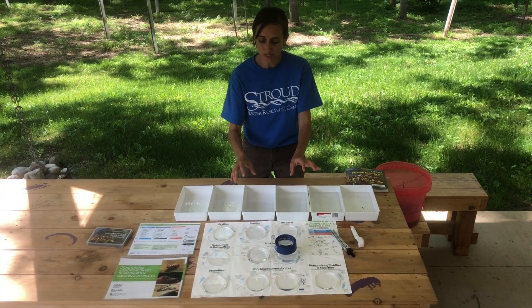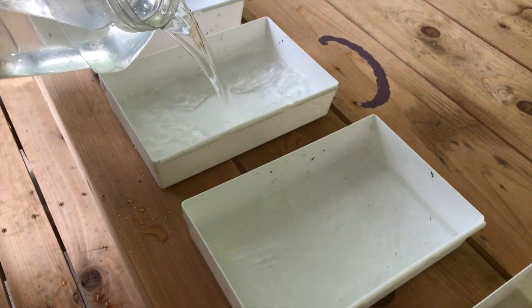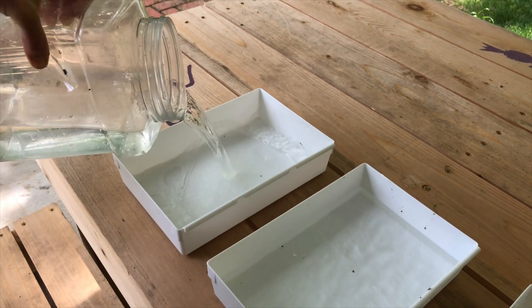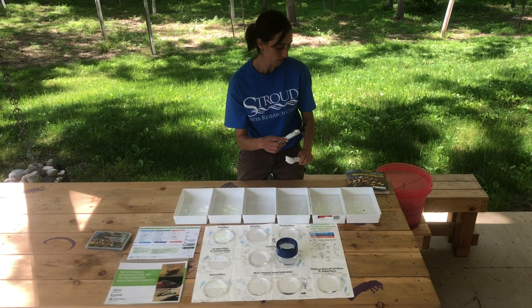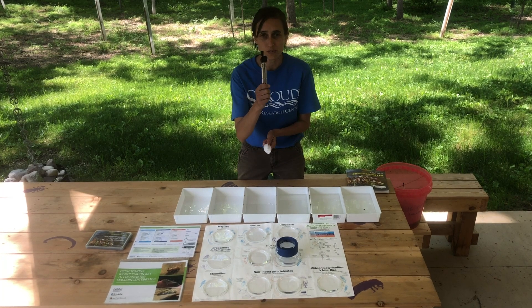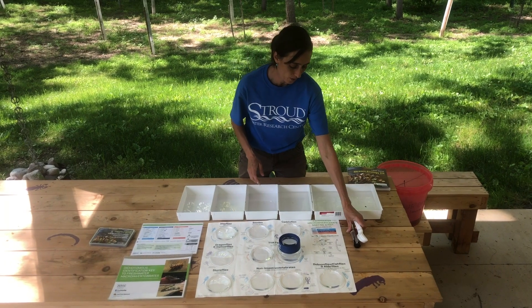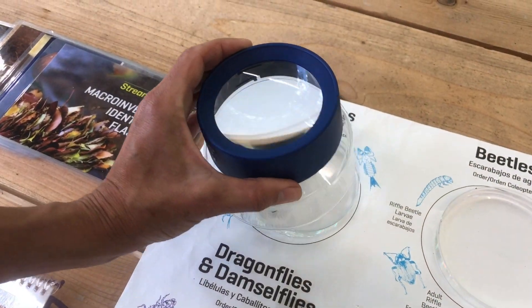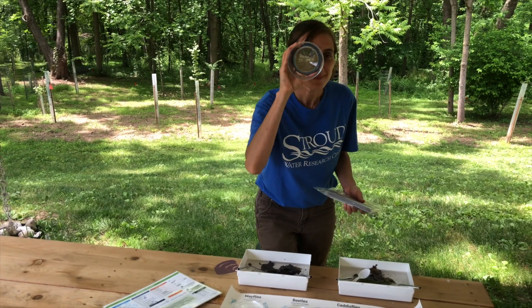Then the sorting begins. You need to pull out all the macro invertebrates from the leaf packs and sort them into different taxon groups. Get out those white sorting trays and fill them with some water. You can use plastic spoons to catch and tease out the critters from the leaf packs, and these paintbrushes are really handy — they help you be gentle so you don't hurt the macro invertebrates. Hand lenses are also great, as well as the big blue lens.